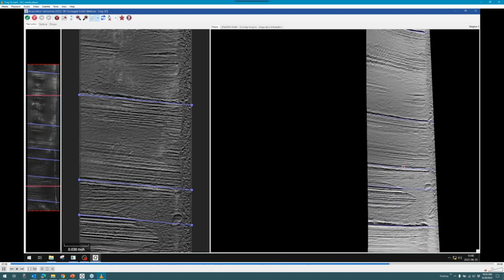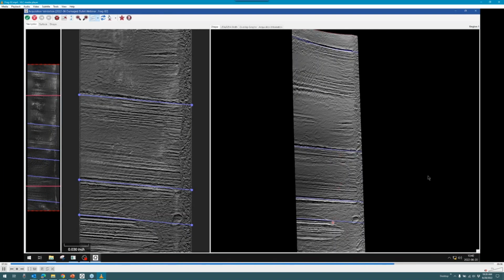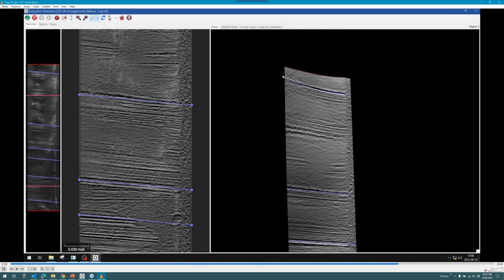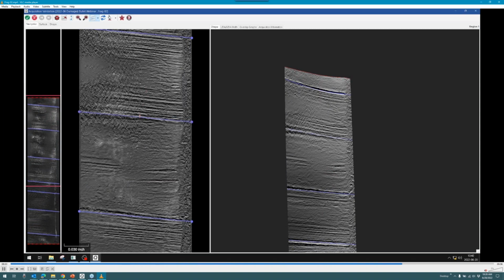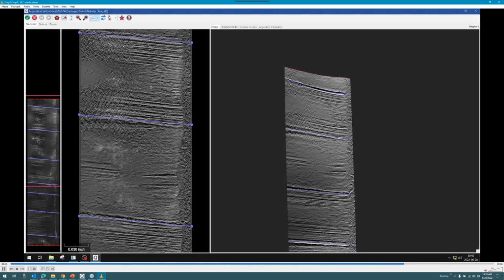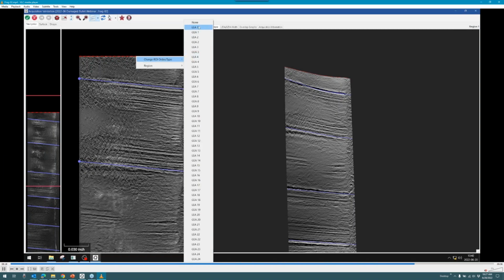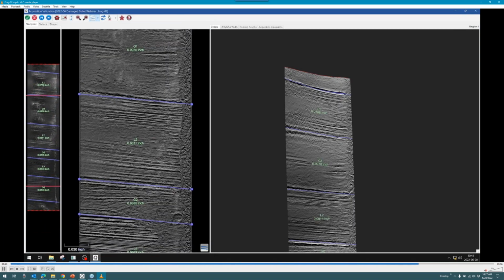But now we can align this up for a more or less top-down view to help complement what I'm seeing over here, and that will help me set those anchor lines accurately, just like we saw in the first recording. Here I need to add one. When you want to change the anchor line angle, you can grab the circle on either side here and it will pivot off of the opposite circle to let you adjust the angle as much as you need to make it accurate to the striae that's left on the surface.